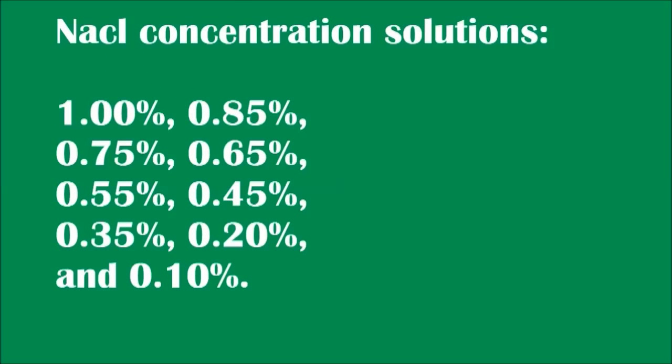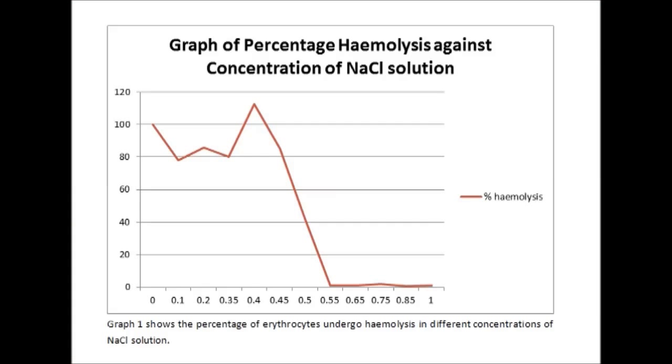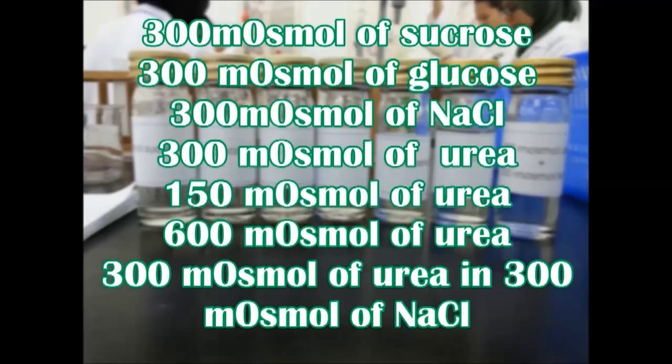The whole experiment is then repeated using the following sodium chloride concentration solutions. A graph of percentage of hemolysis versus sodium chloride concentration is plotted. The whole experiment is repeated again using the following solution.